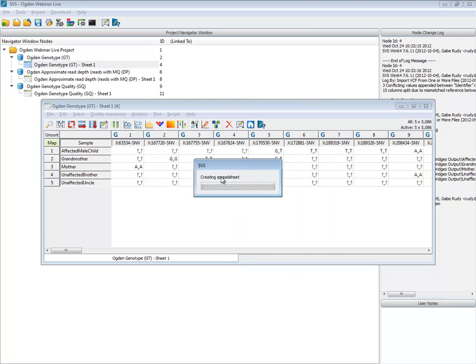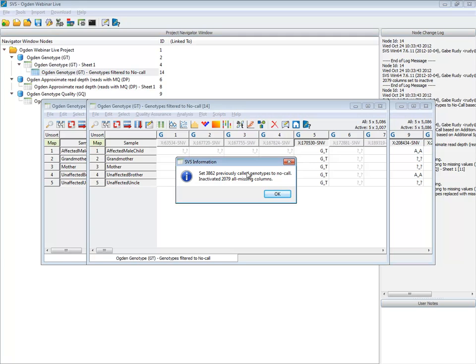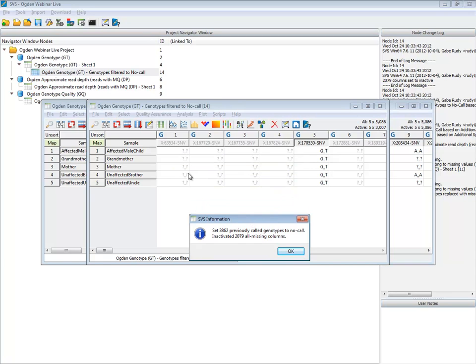So 2 things happen. Not only do we drop those genotypes, but we also inactivate columns that now don't have any genotypes in them. What that shows us is we've gone from 5,000 variants imported in our all filter to just 3,000 left.